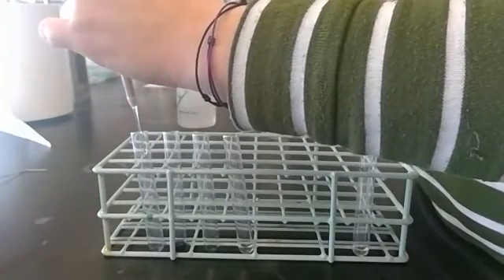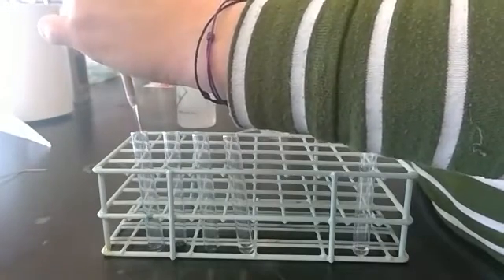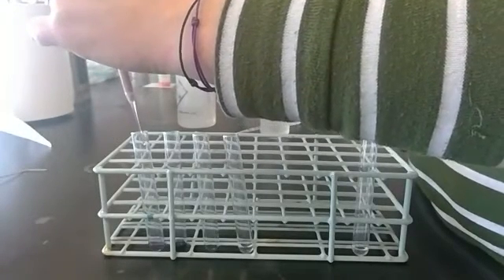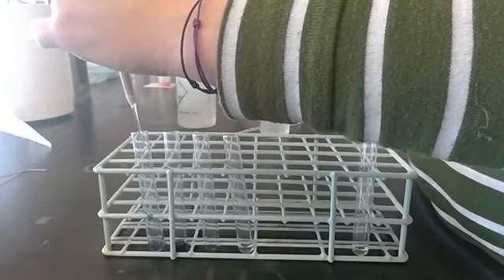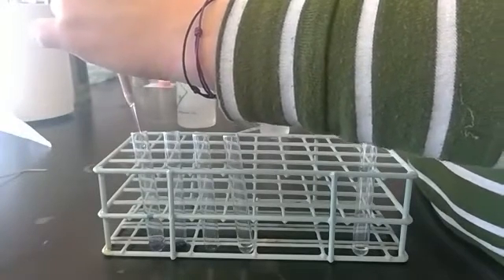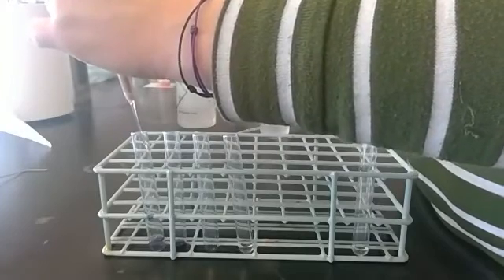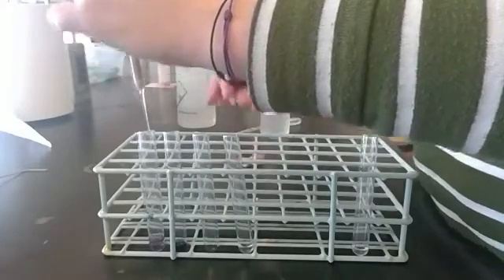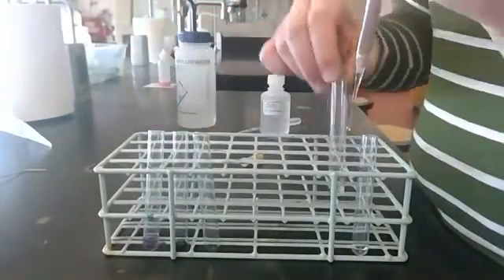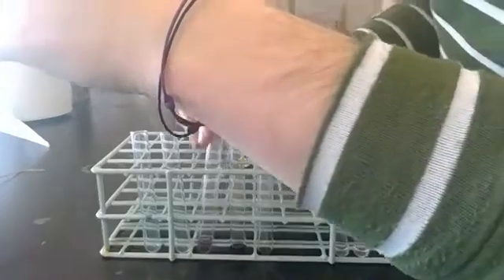So it's just coming out clear. There's a little bit of blue color to it maybe, or purplish color. Which tells me that maybe there's a little bit more red now in the solution, but it's really light. Okay, so we didn't get anything. We got that purple color out. Now we're going to do water.